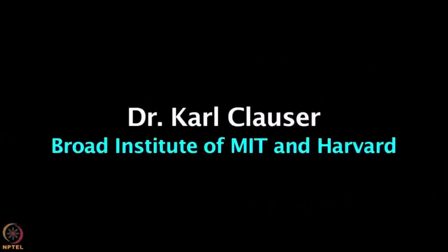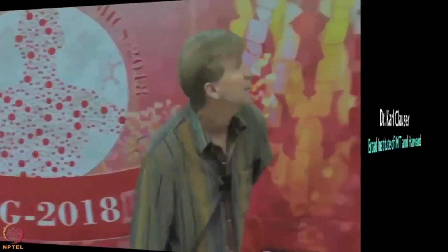Extra things might be possible to use in reducing your list to the confidently assigned peptides. Some scoring systems are going to be used, but we're almost never these days going to collect one MS spectrum at a time. We're going to stick it in a machine, and the machine's going to go generating mass spectra as long as it can.